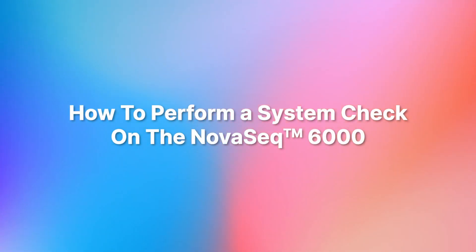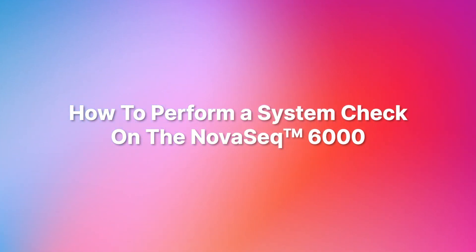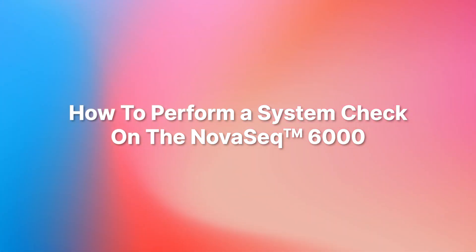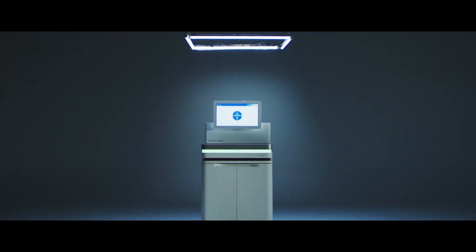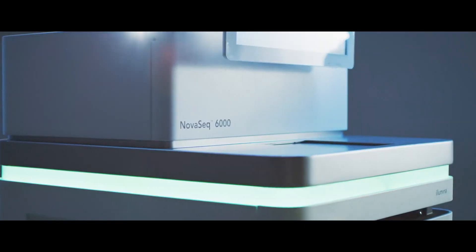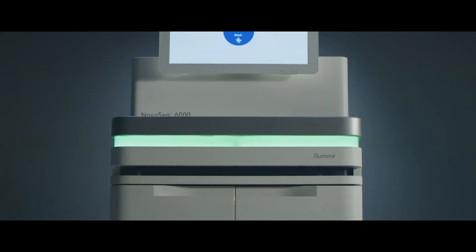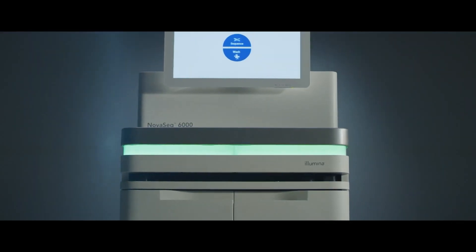How to perform a system check on the NovaSeq. The system check is a diagnostic test that can help troubleshoot potential issues before the next sequencing run. Only perform the system check when recommended by Illumina Tech Support. The system check will take about 60 minutes.